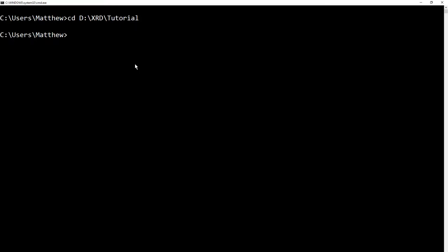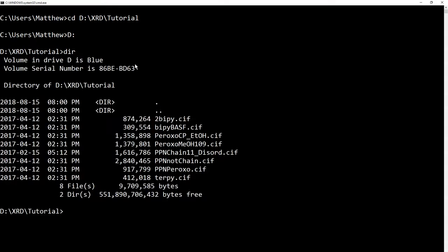It doesn't move because in my case, maybe not yours, my files are on a different drive, so I just type in that drive letter, hit enter, and we're where we need to be. To see the files in this directory, we type in dir, and there they are.